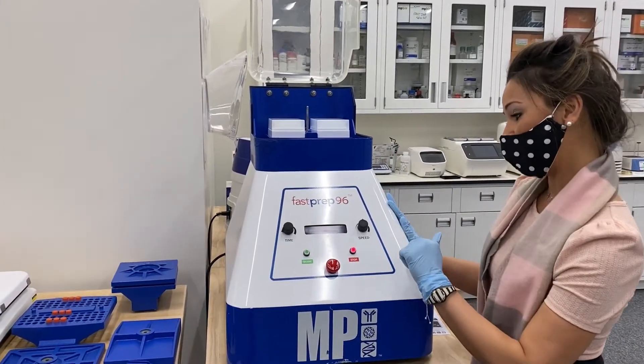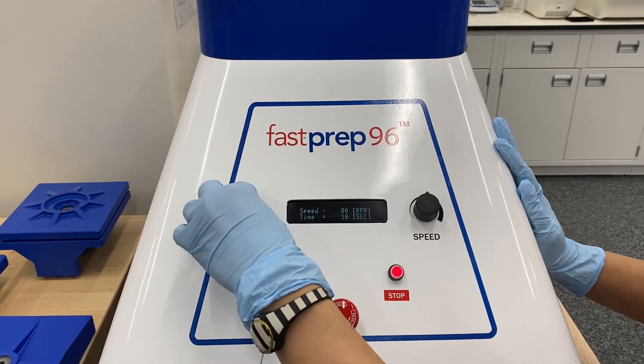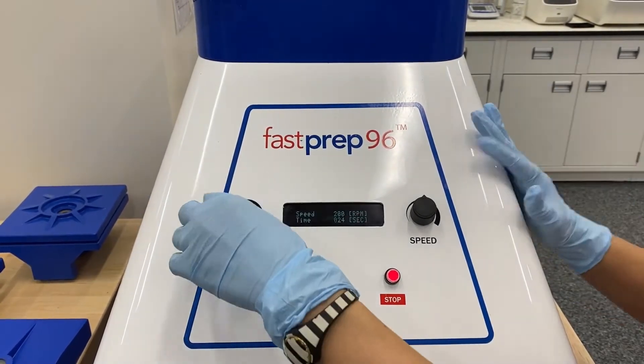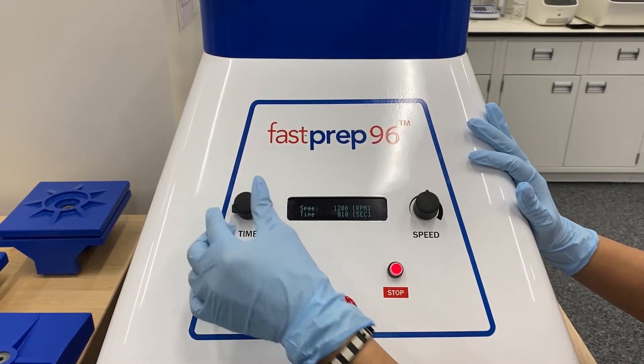If you want to come closer, you can see the two knobs we have. One for time, so you can increase the seconds and decrease. It goes all the way up to five minutes. You most likely won't ever have to run a cycle that long. For today's demo, we're just going to do about 10 seconds just for demonstration purposes.